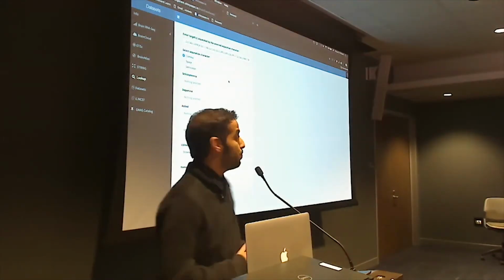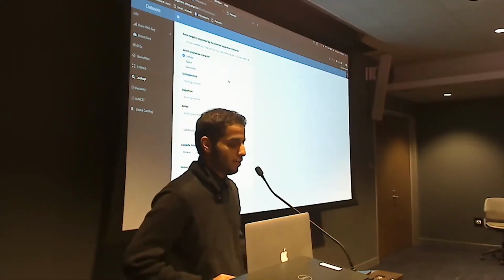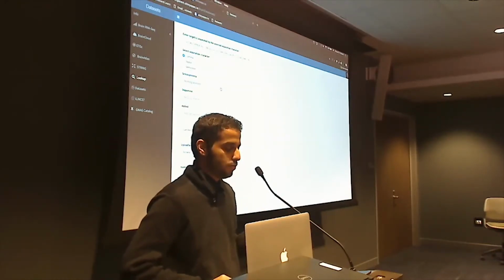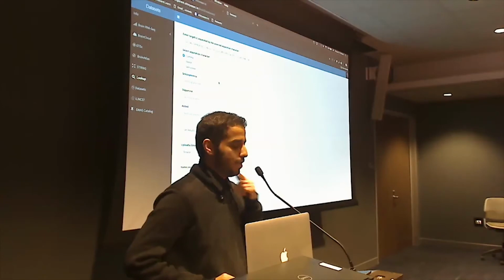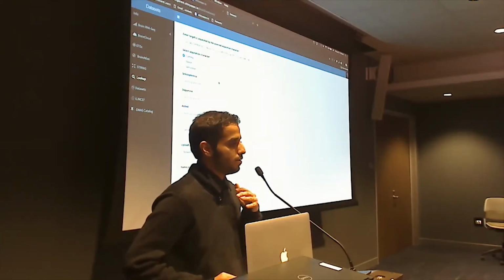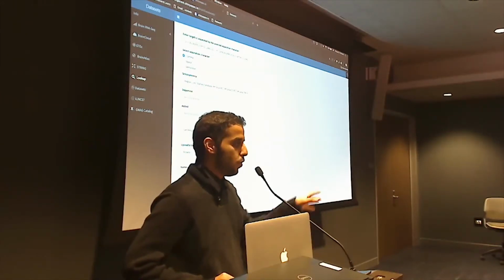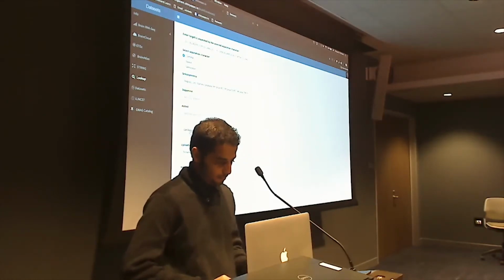Now we have the lookup page. This is where the software starts with the lookup of replication studies and previously published data sets. So we have these models of diseases. Since our lab focuses on schizophrenia, we have extracted previously published data sets related to schizophrenia, and then we can compare the expression levels of these targets in control against the schizophrenia patients.